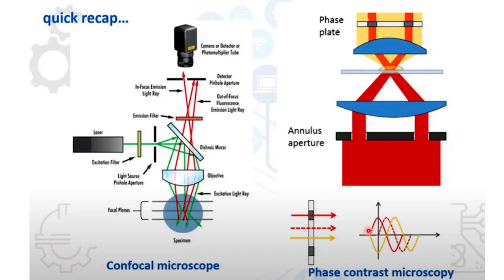And we have also discussed different types of microscopes, different advancements of microscopes, for example the confocal microscope, and we have vividly discussed how you can get a 3D image through the confocal microscope. First you take the image of the surface and then slice it, and again take another image beneath the surface. In that way you take 3 or 4 images, and through software you create a 3D image of the object.